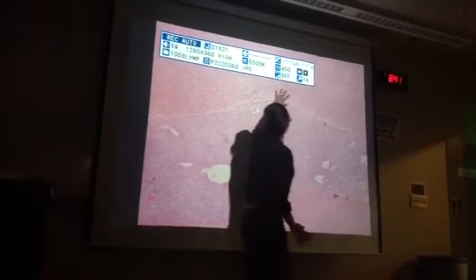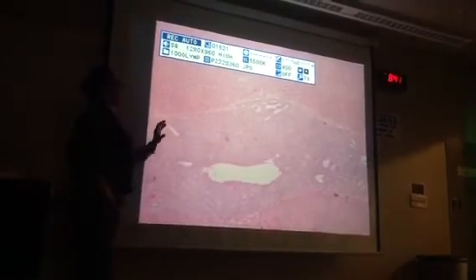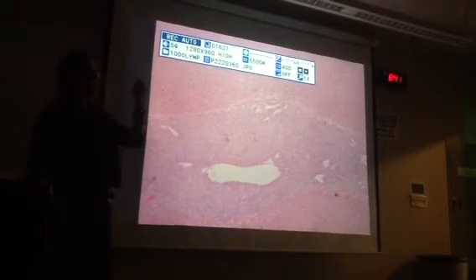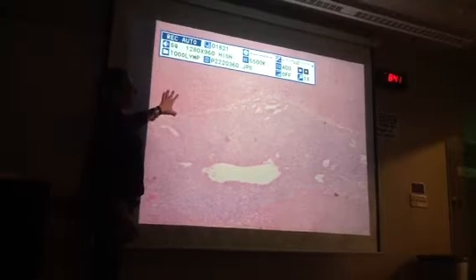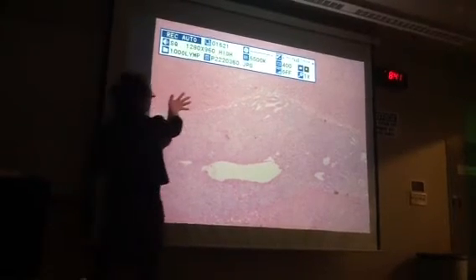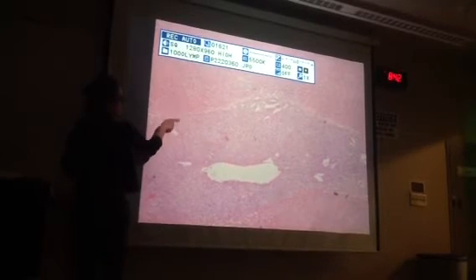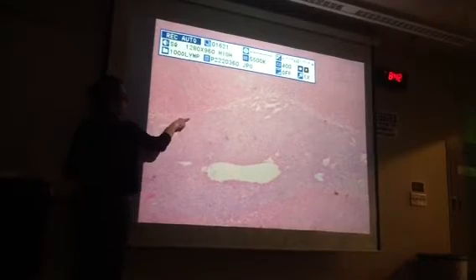When you look at these cells, it's not a real big, thick layer. Glomerulosa is going to be the smallest layer, then reticularis is a little bit bigger, and fasciculata is the biggest layer. But when you look at this layer, you should definitely see a color switch between these that are pinker, and these that are more purple.